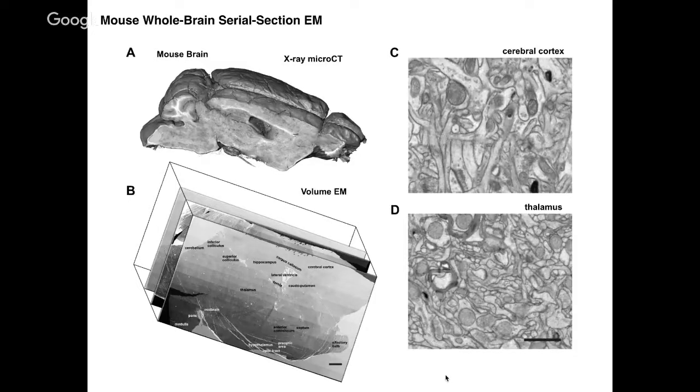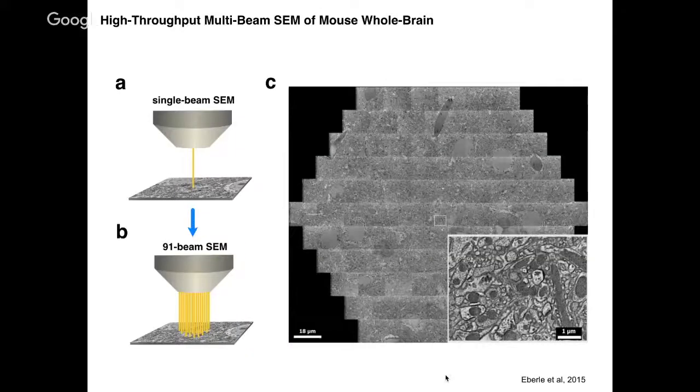With this being said, one final thing is that, of course, the brain on tape and all of these brains are compatible with the multi-SEM. So this is actually showing block-face imaging with a 91-beam multi-SEM. The contrast is actually much higher with thin sections, like as you would have for the brain on tape. Now, I've sort of gone through the EM. I don't have that much time, so I want to just quickly say something about the nano CT.